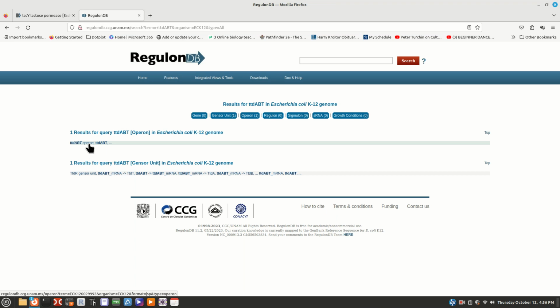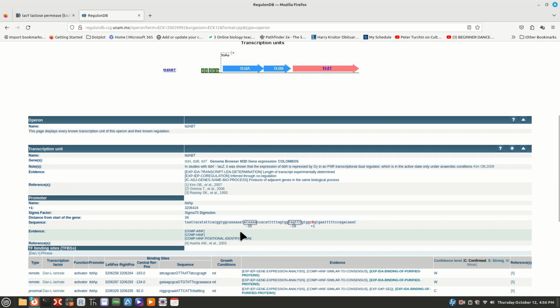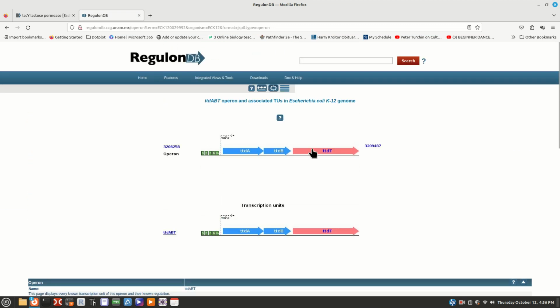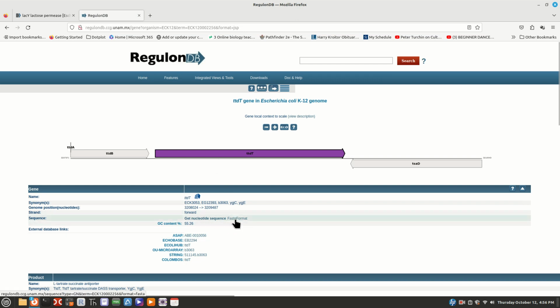So yes, I was thinking this one didn't work for this. But it looks like, oh, they give you some details here. Okay, so click on this, you get the nucleotide sequence for this one and this one. The hard part is going to be finding if there are any pieces in between there. All right, so you may have to search the entire genome, go to NCBI and search the E. coli K12 genome and find the intervening sequences between these two.